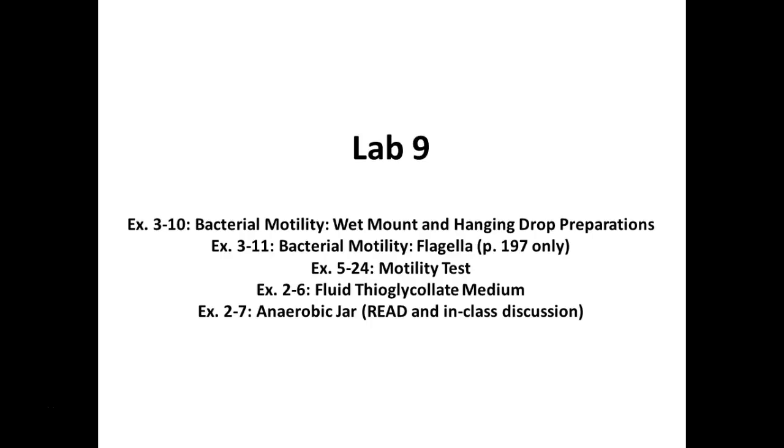So hopefully, when I get a chance to look at them, we can add them in, and you guys can take a look at these prepared slides where you can actually see the flagella stained. The flagella are teeny tiny, and you have to do a special staining procedure to make them appear thicker than they actually are to be able to observe them under the light microscope. I've got some potential slides. I had a really nice slide, and it walked away, and I was really upset. But I've got some more that hopefully might still be good. I just haven't had a chance to look at them. We just refer to that one for reference. We're not going to hold you to looking at those slides.